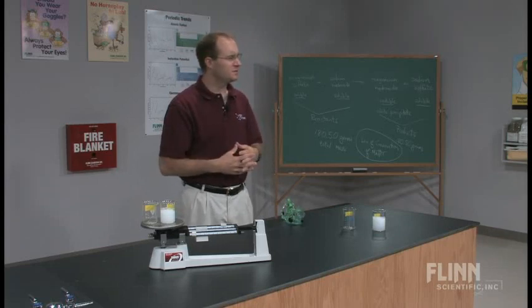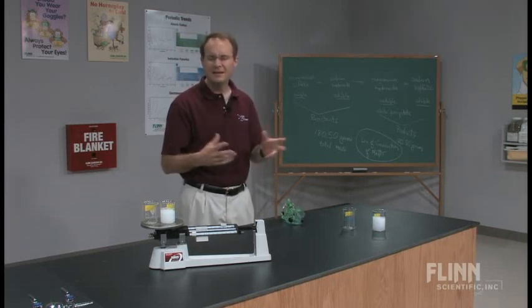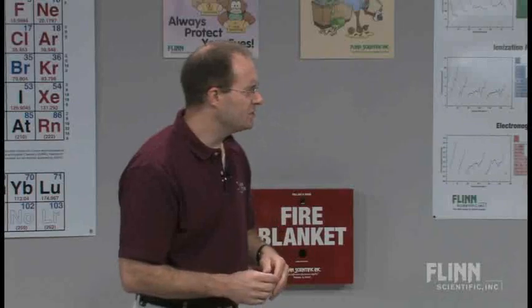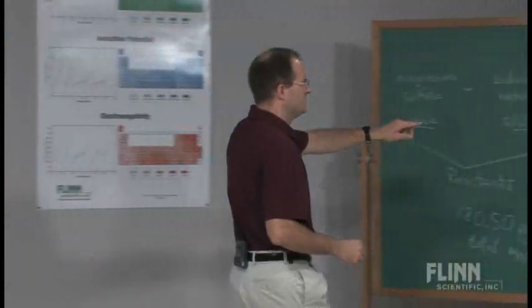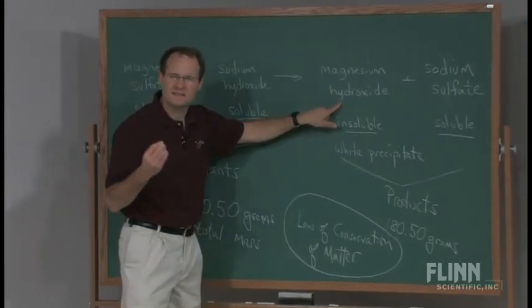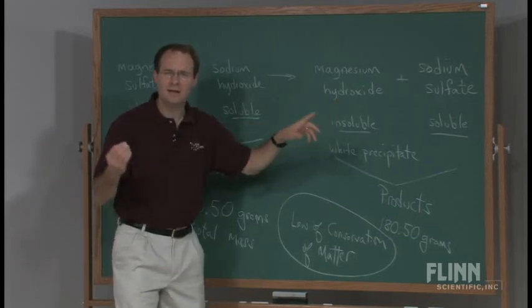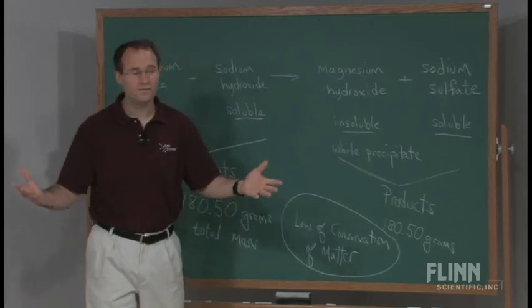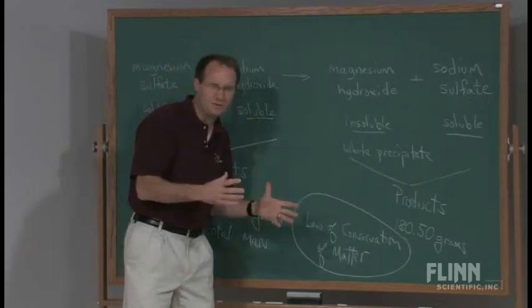If you ask the students, magnesium hydroxide, what does it look like? Someone in your class will eventually say, milk. It's a good time to point out magnesium hydroxide sounds like a chemical. And the media would have us believe that all chemicals are bad. Vitamins are good for us. But chemicals, not so good.